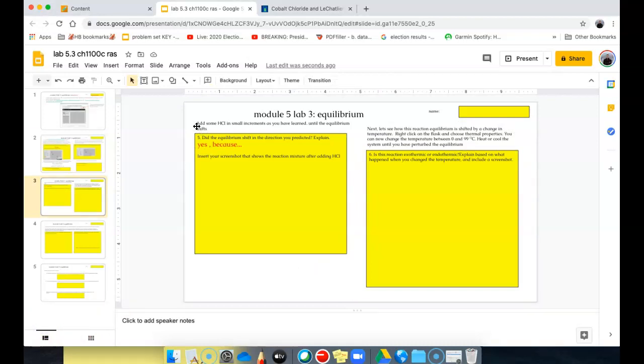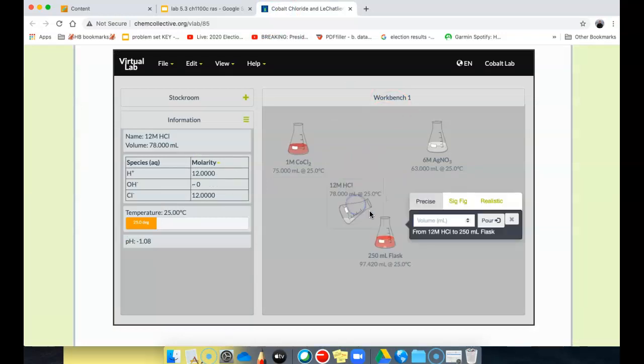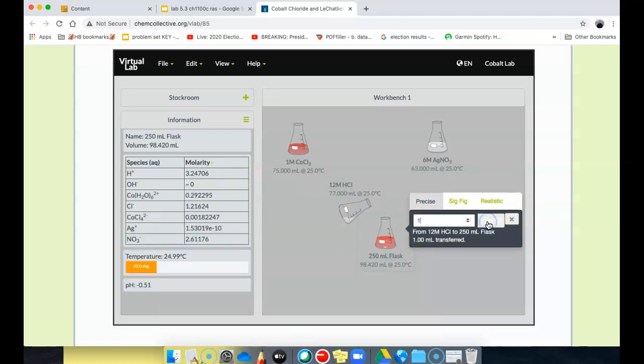Now it asks us to add some chloride in the form of hydrogen chloride in small increments. As you've learned, that means 1 mil at a time, and see if it shifts. So I'll go ahead and grab the HCl, and I'll make it 1 mil increments, and let's see what color it turns. Now we are at 98, so close to 100. Just remember, I think we're at 97. So let's go forward until it changes color.